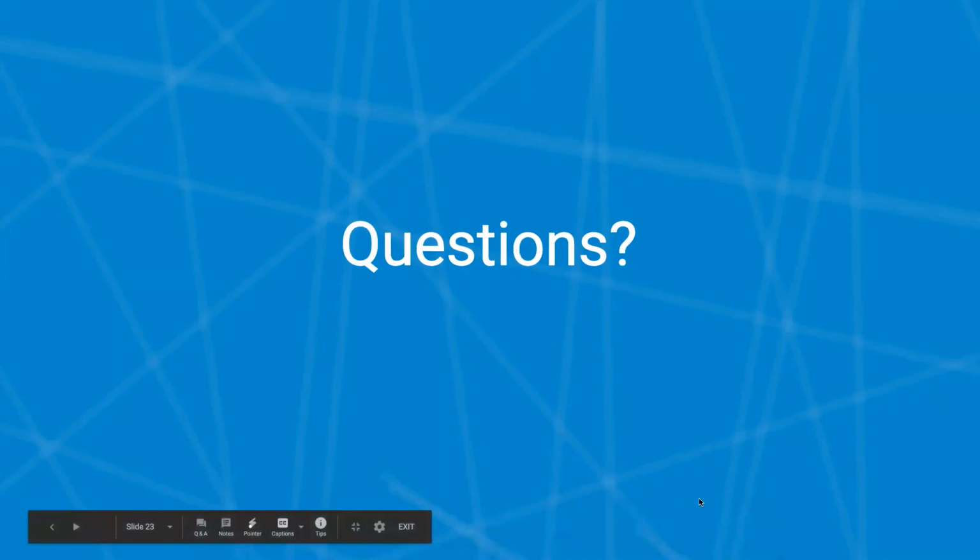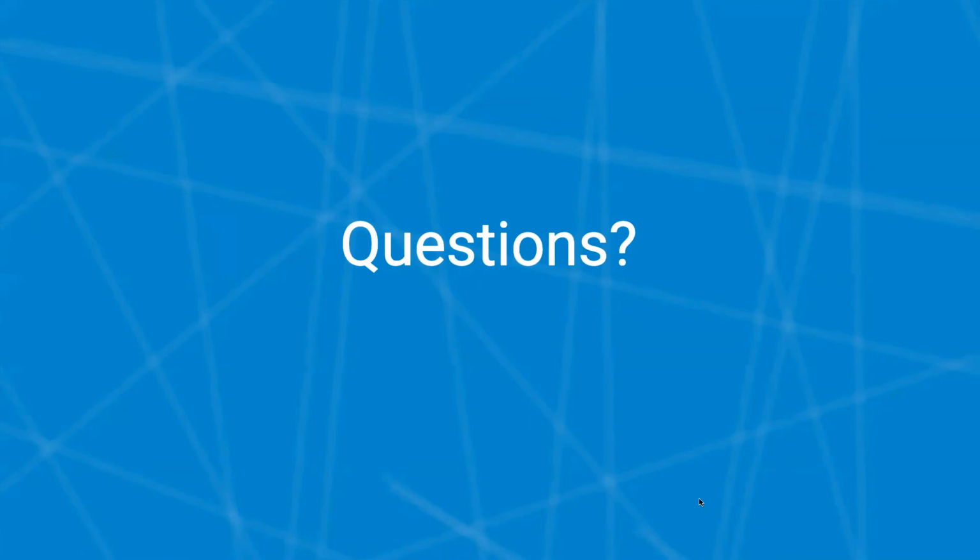And then another question is, do you need another software to perform data analysis on the samples and generate reports? And our answer is right now, yes. Ideally, we're going to build in reporting tools and further downstream analysis into this application. But we really want to just focus on these core features first. And then of course, the next one being freezer management. But if you sign up with us, these are things that will eventually come over time.